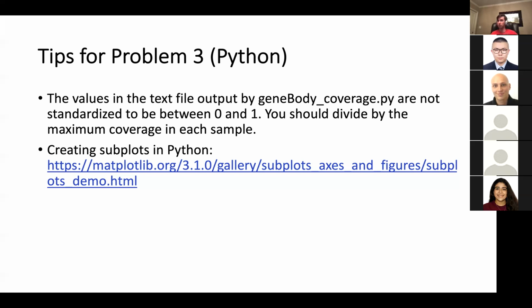I've not tried to run Python in R Markdown that much. One option is just to do it on some other IDE that you use for Python, and then copy the script, put it into R Markdown, and specify eval equals false. If it's convenient for you to run it within R Markdown, do so, but it's not a requirement. If you can't get pandas to load, then just specify eval equals false in your chunk.